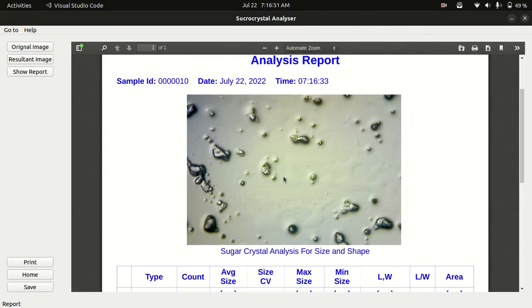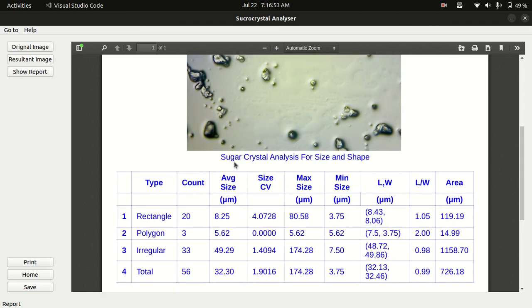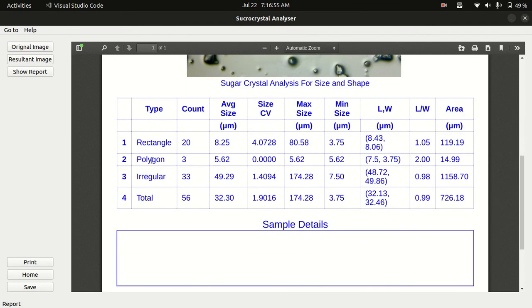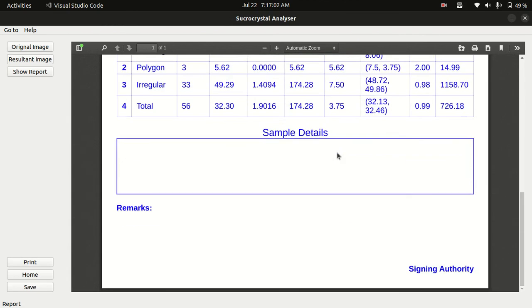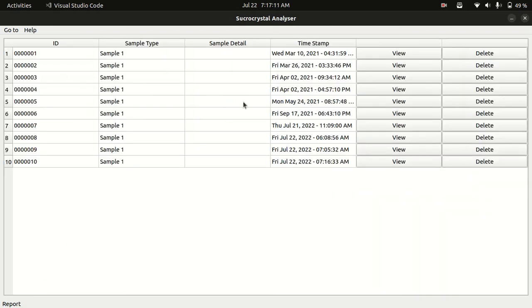You can see different types of data. You can see the count of every type of shape here, and max width, mean size, length and width of every shape. You can also print it or save it, or you can go to home to view previous results.